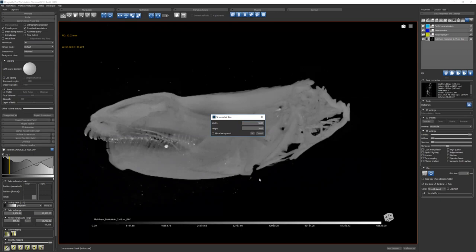But I guess what's given to you as the default is already the 1 pixel, 1 voxel ratio. So if you increase that, you're actually not increasing the information content in there. The DPI, yeah, you're just making it bigger. So you don't have the same control like you have with Mira. That other program has much better visualization abilities.